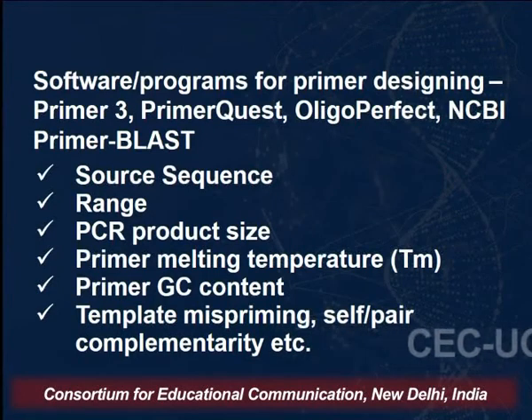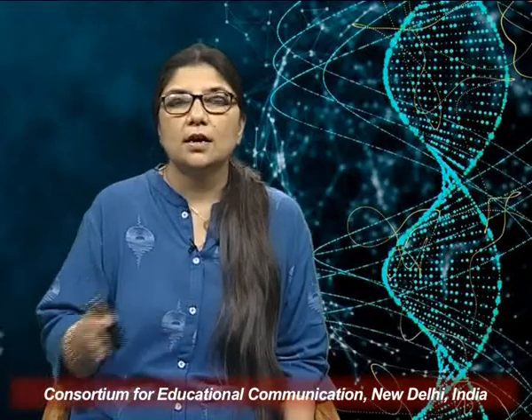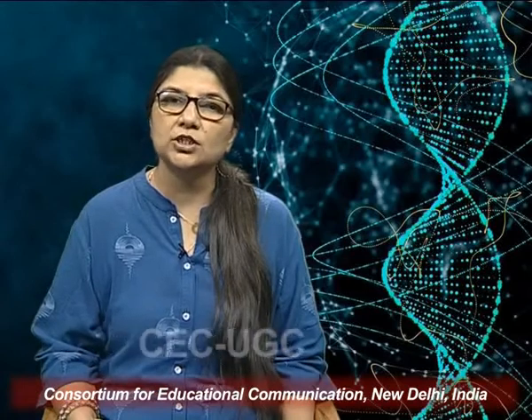So you require the source sequence, and you require the range for the primer, because you do not need the entire genome, but only a particular region from which you design the primers. The PCR product size is given, and the primer melting temperature range is given. We do not want the range to be very high, we do not want it to be 80 degrees; it is somewhere around 50, 55, maximum 56, 58, that is the ideal primer melting temperature.